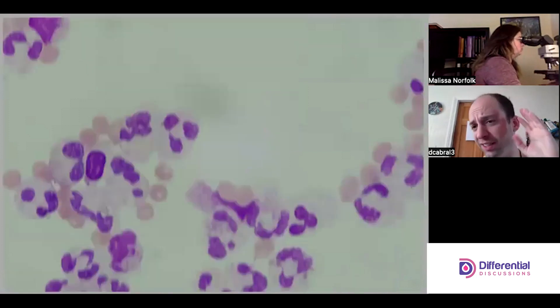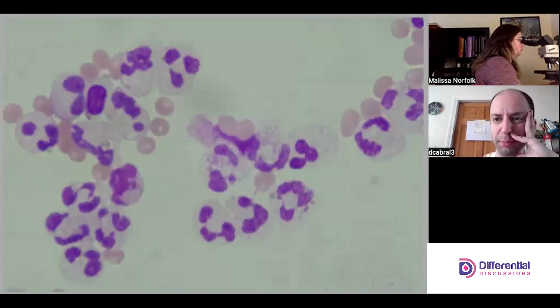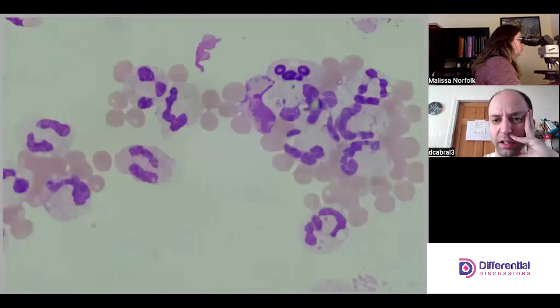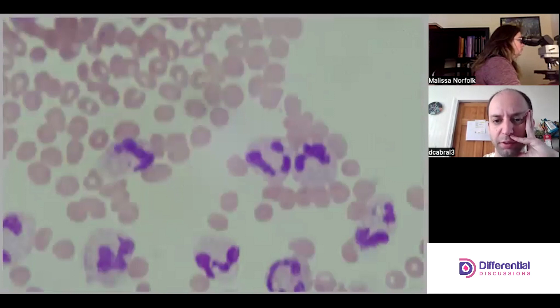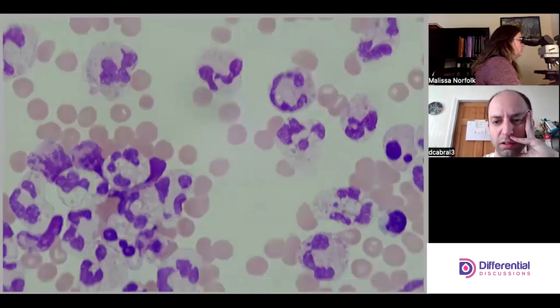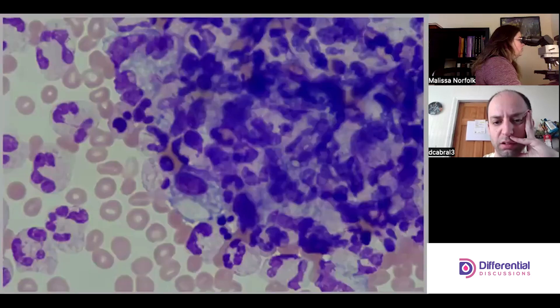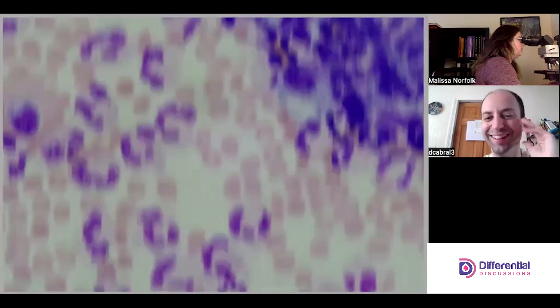If you're really on the fence and it's important, you can also correlate: if a CBC was done recently, NRBCs should be present in the CBC and correlate somewhat to the body fluid. I wouldn't expect to see NRBCs here. Let's skip those clumps — we'll be here all day.